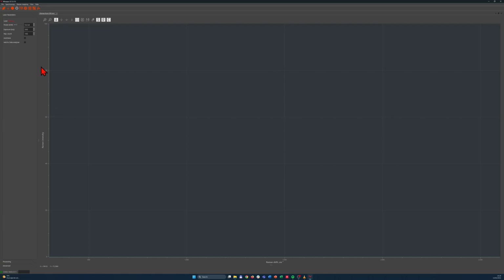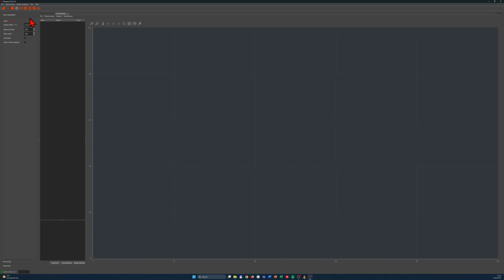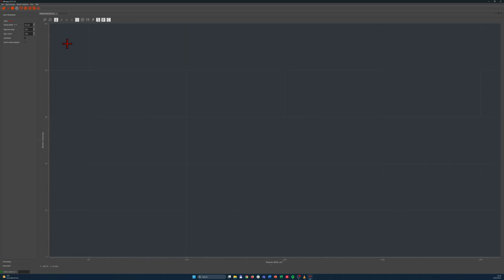And then we have the data analysis option, the data analyzer tool. Let's click on it. When we acquire the data, we can add it to the data analyzer by clicking here. Then it would be automatically added to the data analyzer, and all the data files will be shown here. Then we should be able to save it. Let's go through the data analyzer later. The Raman mapping menu is irrelevant in this case because it's controlling microscopes. Our software can control both spectrometers and microscopes from Lightnovo.